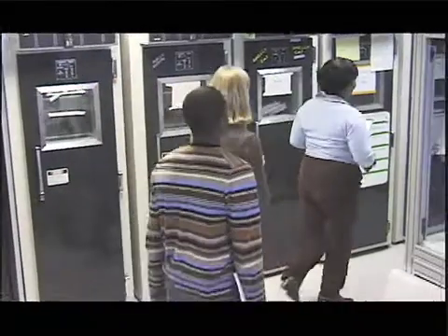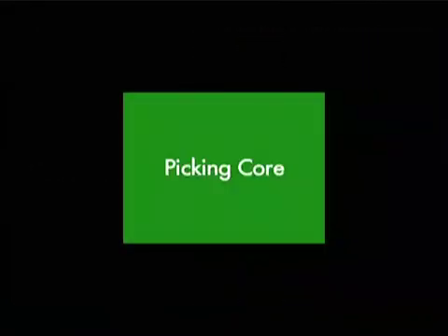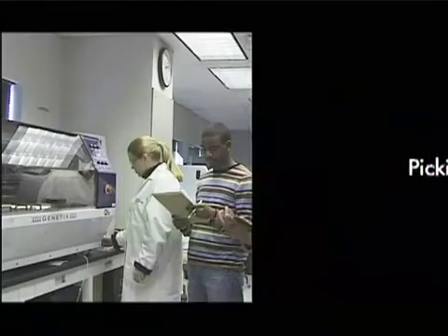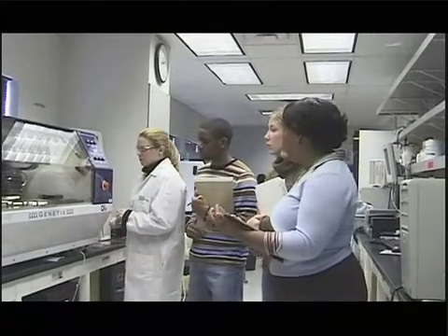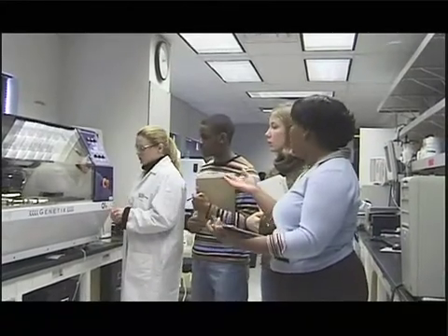Okay, we're off to picking core now. I think you'll really like it there. The picking core technician retrieves large agar plates from the incubator, and then she places them on the Cupix machine.